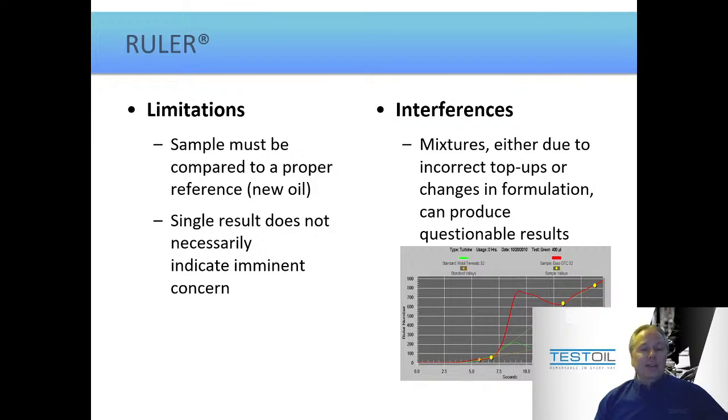You may find that your acid number climbs at a slow and steady rate, but your RULER value drops much more rapidly. And the concern will be that at some threshold cutoff, generally very low levels, like around a RULER value of say 20 to 30, you might suddenly see your acid number take off. Because at that point, your oil has very little antioxidants willing to fight the degradation that's occurring. And at that point, you would need to schedule either an oil change or some sweetening. Whereas acid number, you just watch slowly climb steadily, steadily, steadily, and then all of a sudden there'd be a major inflection, and like I said, it would take off.